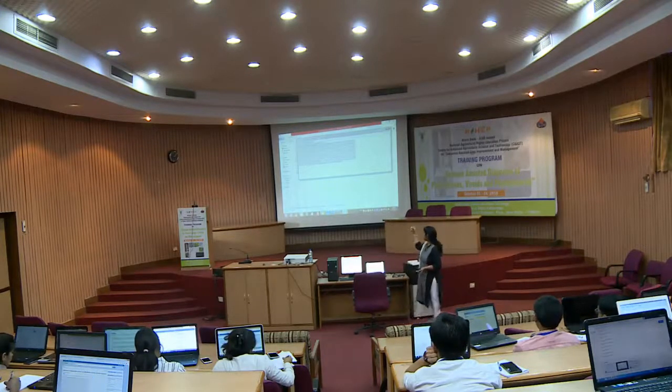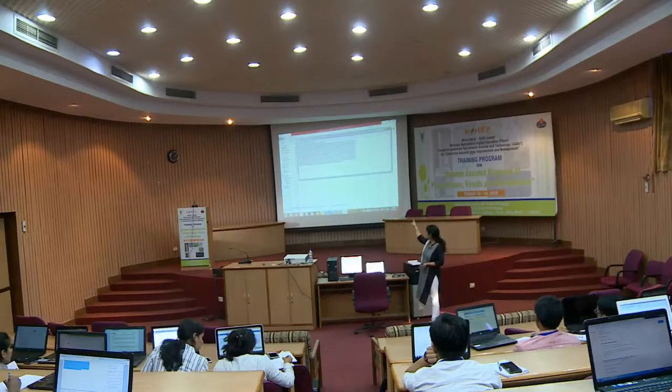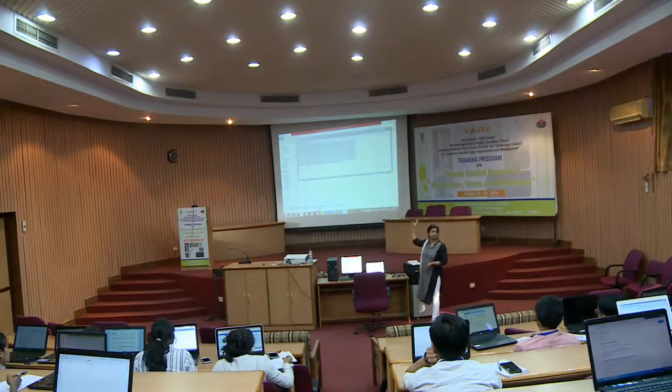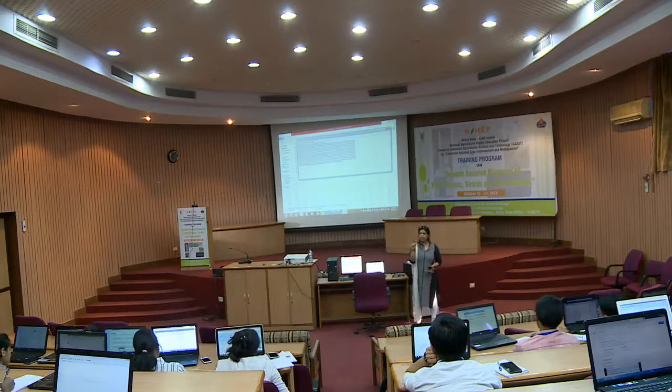So, never ever just take this and go ahead saying, "My data has come and now I can use this data," because there will be lots and lots of errors in this ACGT, right. If the data is mixed, then also the machine will pick any of the bases, either A, C, G, T, right.